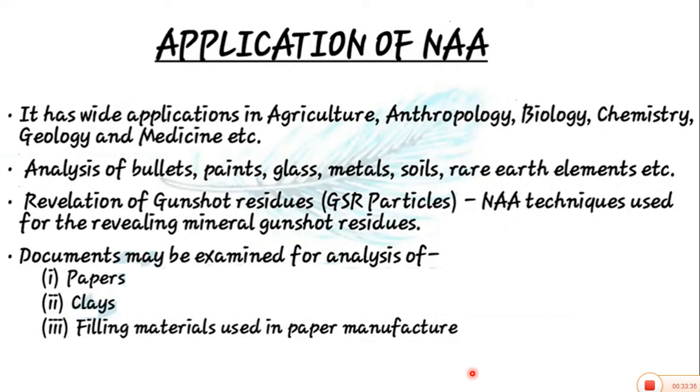Inshallah, in the next lecture I will give you some applications that were actually performed practically, and let's see how it is possible for neutron activation analysis to analyze different kinds of elements in different sample materials, which is not possible with usual analytical techniques for measuring different elements and metal atoms inside the sample material.